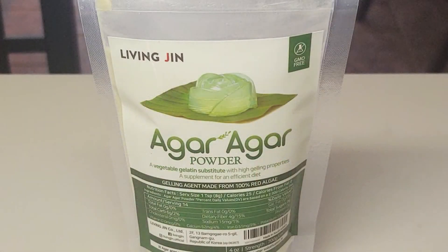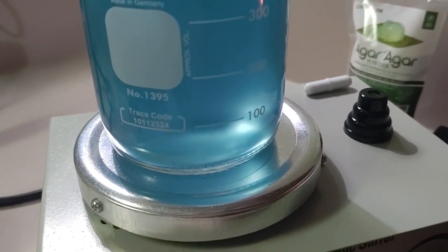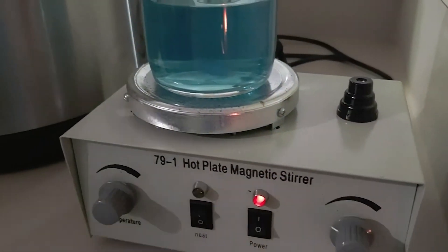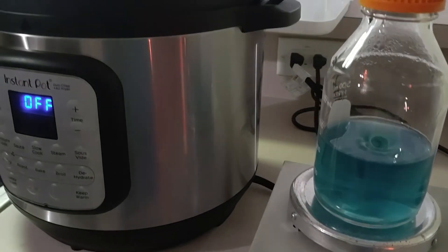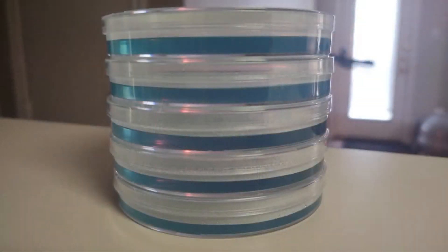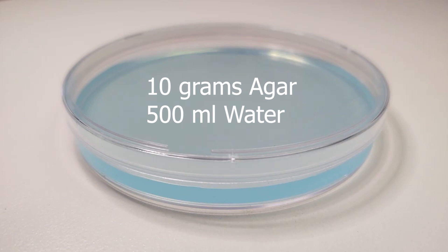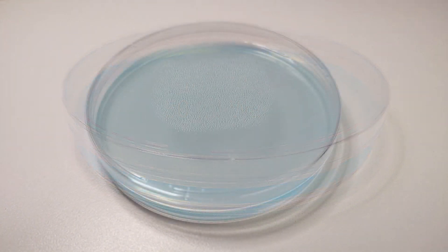Our recipe uses 10 grams of agar for 500 milliliters of boiling purified water, or you can use 5 grams of agar for 250 milliliters of water. Using 90 millimeter petri dishes, we pour 24 plates with 500 milliliters and we pour 12 plates with 250 milliliters.